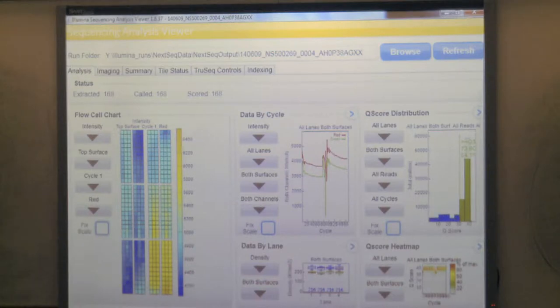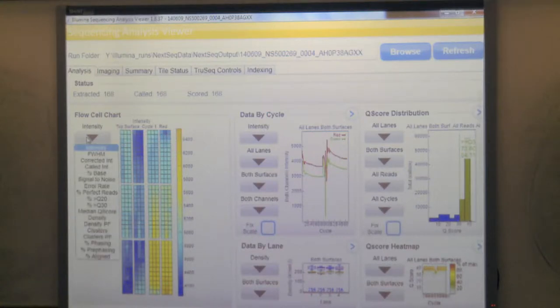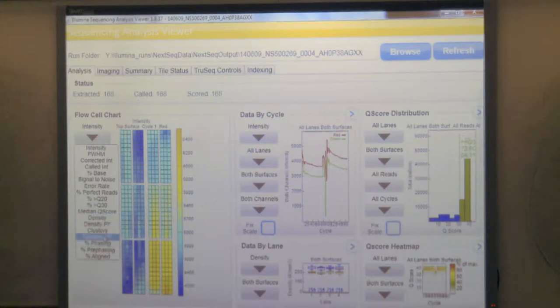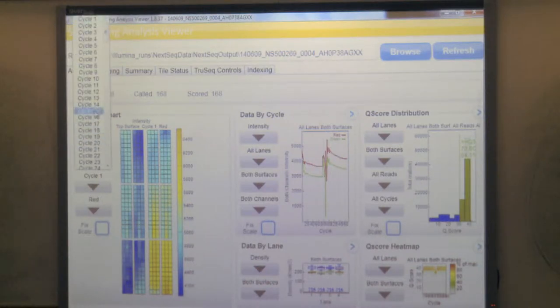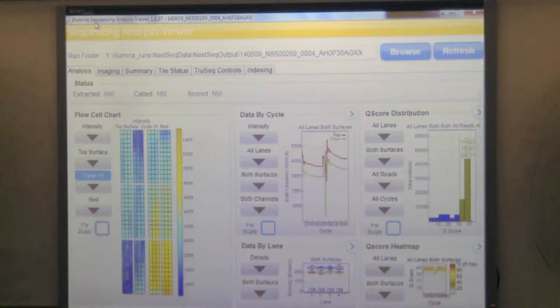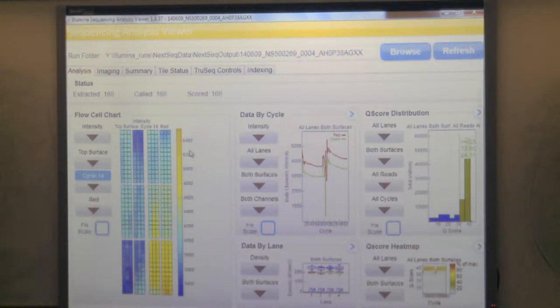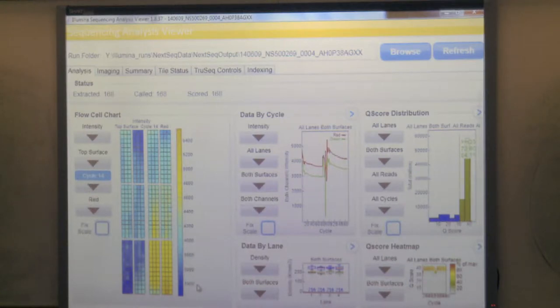Then I have the flow cell chart, which is a heat map for the flow cell. Everything is a drop-down menu, so you can go through different statistics like intensities, Q30s, error rate. I usually look for intensities - you can go by cycle and see everything for all cycles. Some tiles will be on the low range, some on the high range - you have to look at the scale because sometimes the scale is really close and it's not something bad. If the difference were 5400 versus 540, that would be bad, but in this case it looks good.